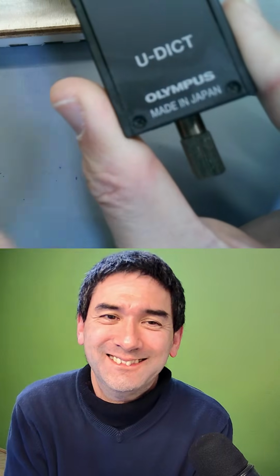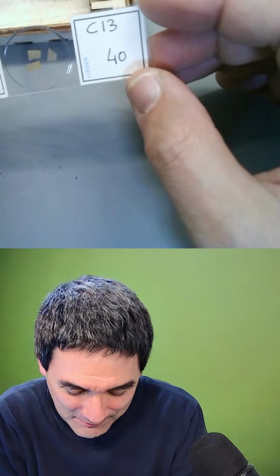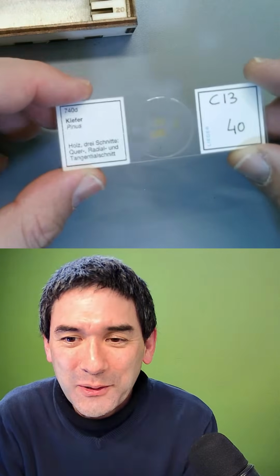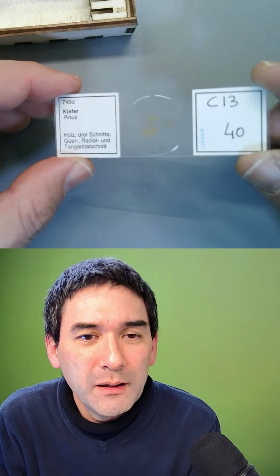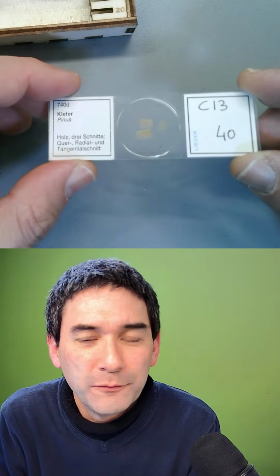They have their own abbreviations. Okay, this one is another nice one over here. This one is wood, in different sections, and there's also one of those slides where you can make pictures.